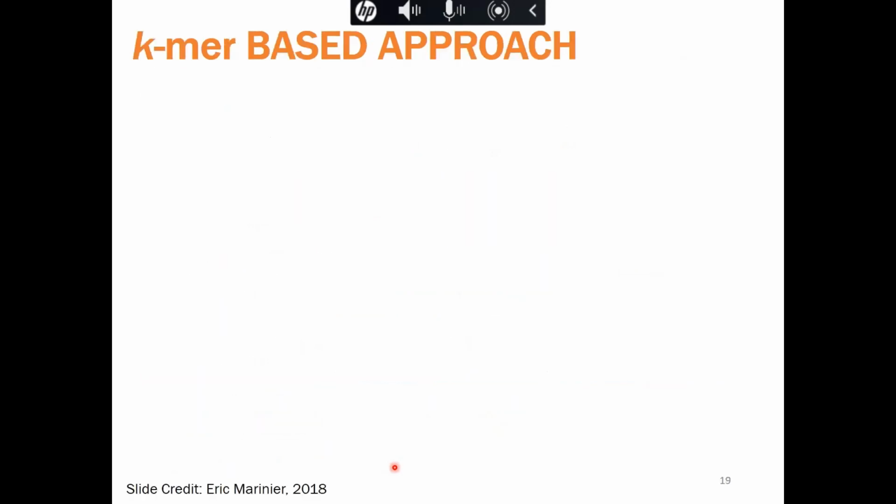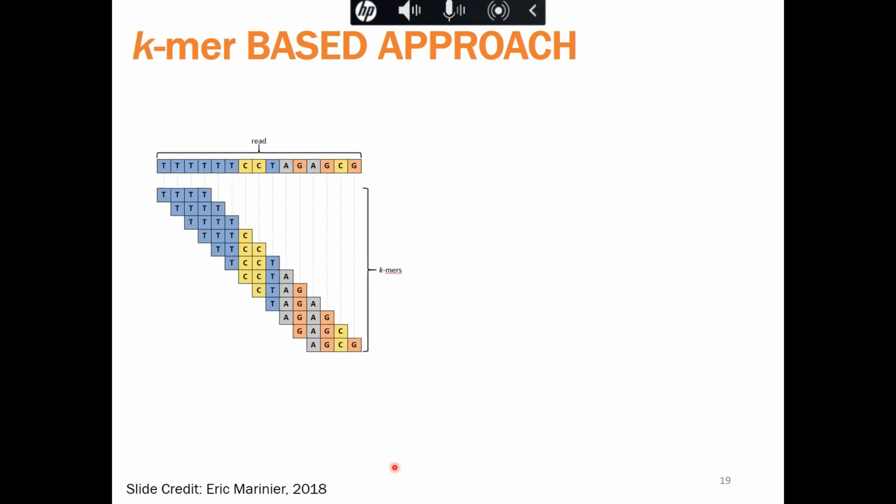So we're going to talk a little bit about k-mers because I've been mentioning it a little bit, and I want to make sure that everyone has a basic understanding of what a k-mer is, as well as a k-mer-based classification approach. So the classification approach for Kraken 2 is based on exact k-mer matching using the lowest common ancestor, or LCA for short. Now, this is one of the more popular approaches, as LCA drastically reduces the risk of false positives. However, it usually spreads the taxonomic level of the classification from the more specific to the more general.